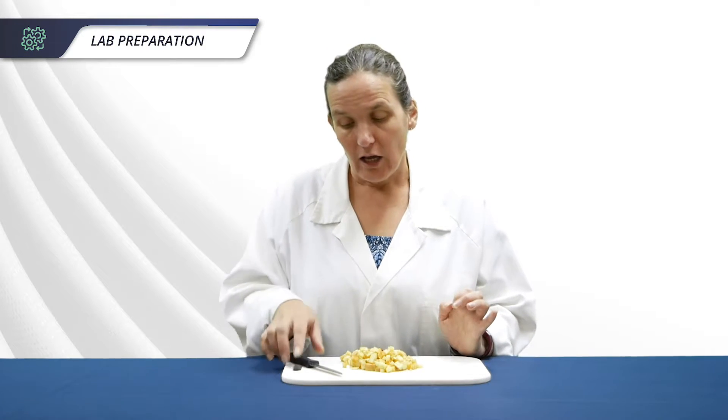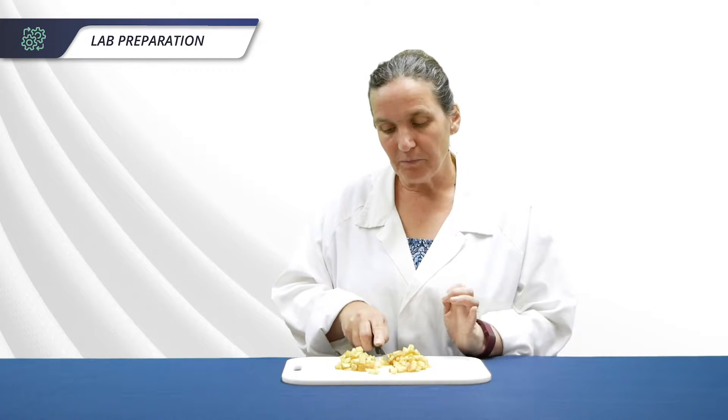It can help to put the apple pieces into the microwave for about 20 seconds after cutting to make it easier for students to crush them. If you do this, don't add water as it will add unnecessary liquid. Your students will need about 50 grams each, or about half of a smallish apple.